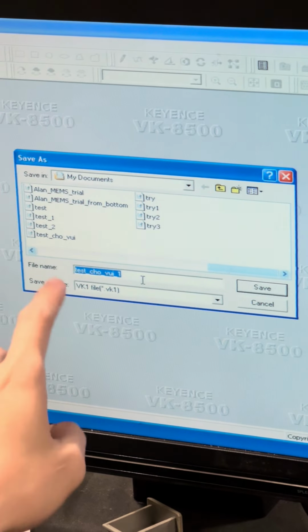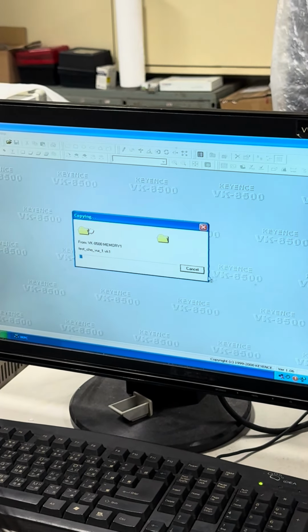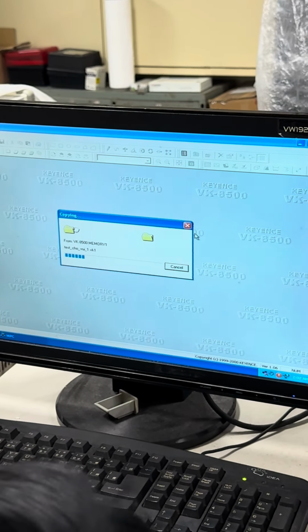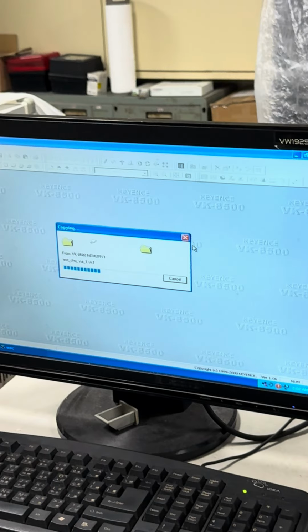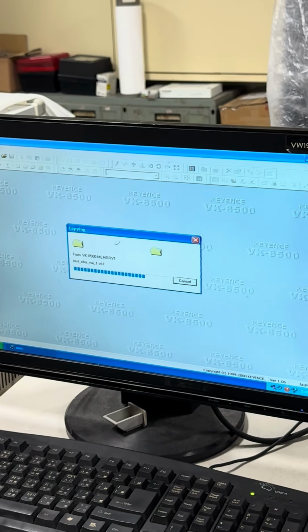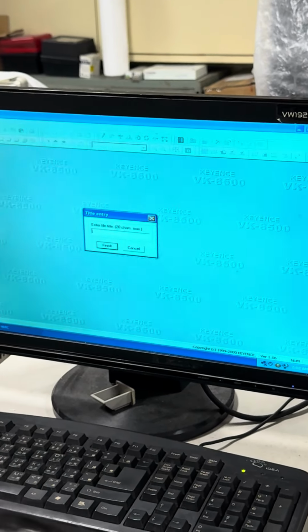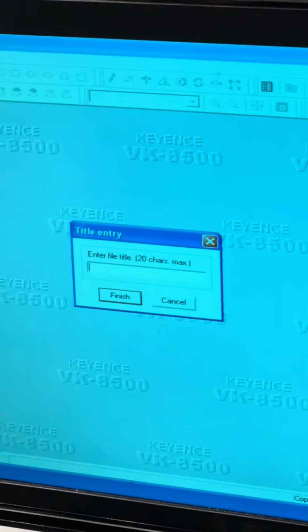Remember to name your file before we make any further step. You can name any title you want.